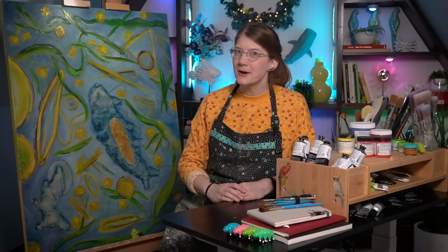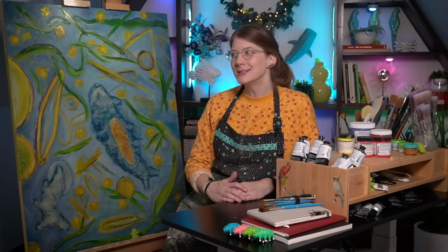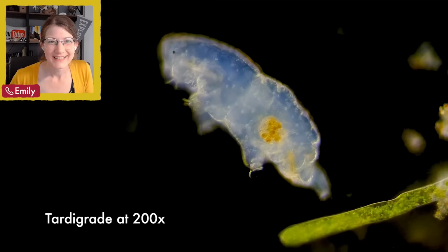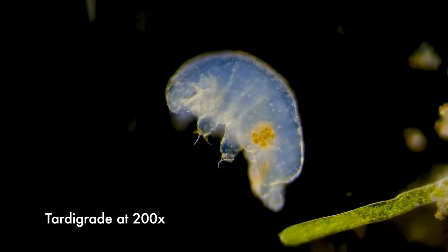Well, Sabine Baring-Gould, I beg to differ, because what James is about to show me is an animal that for a long time I thought was just made up. Wow. This is a tardigrade. Wow. Water bear. I mean, honestly, can you blame me?